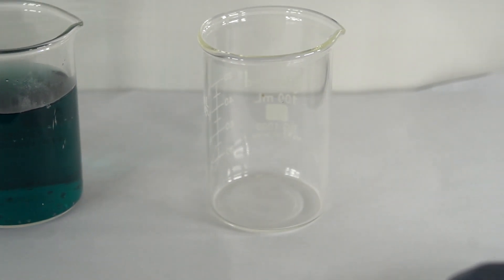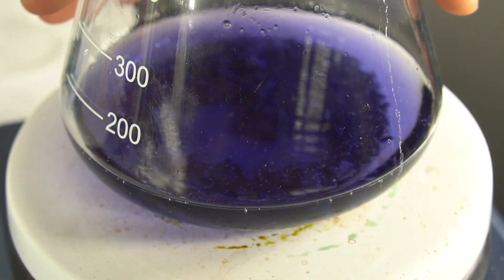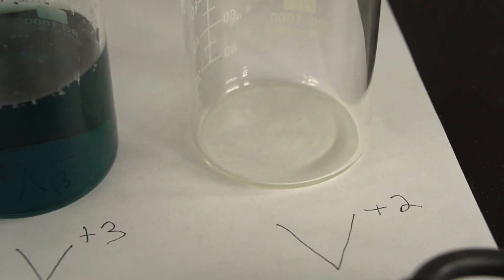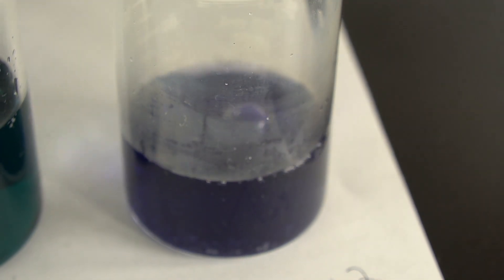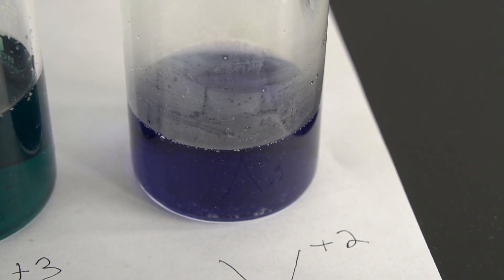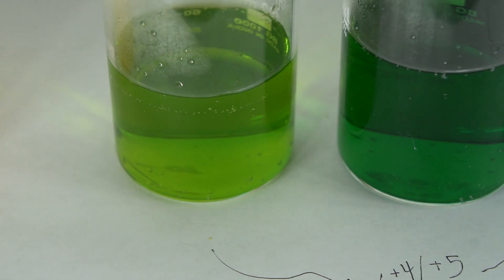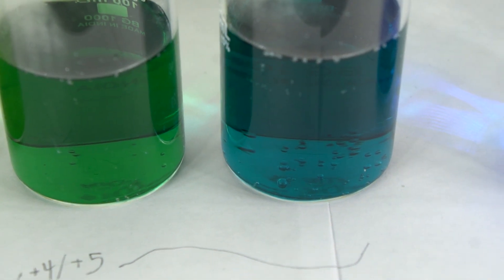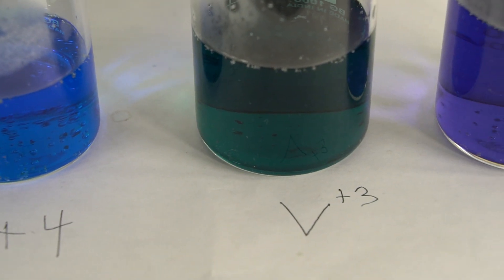Then we're going to make the plus 3 oxidation state, and then the hardest one to make — the purple solution you see is the plus 2 oxidation state. As the zinc is reducing the vanadium, whenever it changes color we pour it into a beaker and label it. So you see the yellow for plus 5, this is intermediate between plus 5 and plus 4, and you can see that nice bright blue color of the plus 4, green of the plus 3, and the purple of the plus 2.